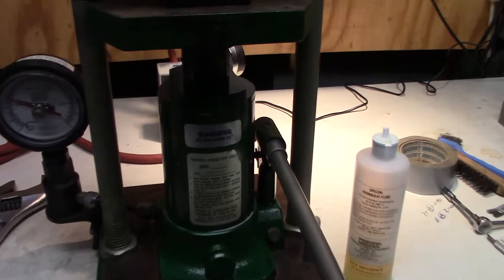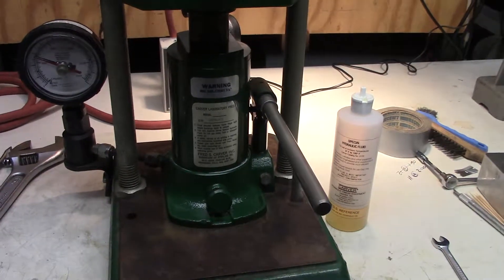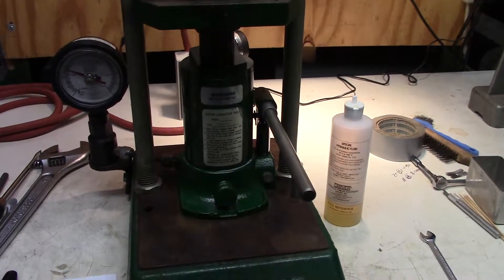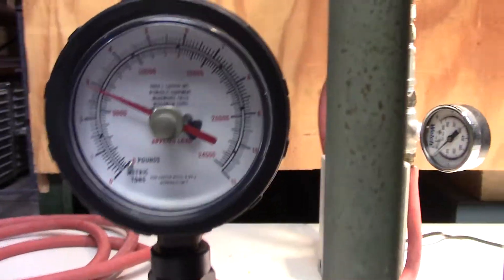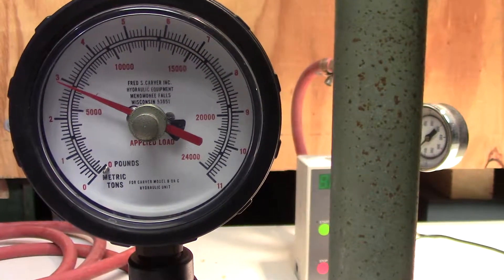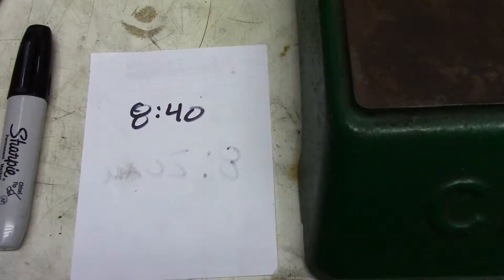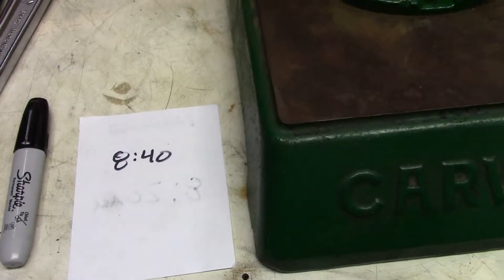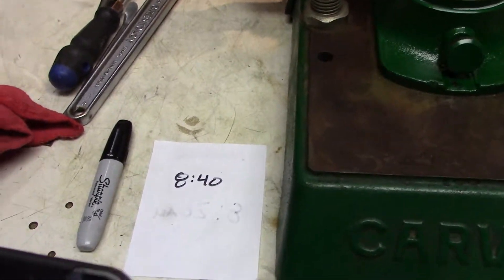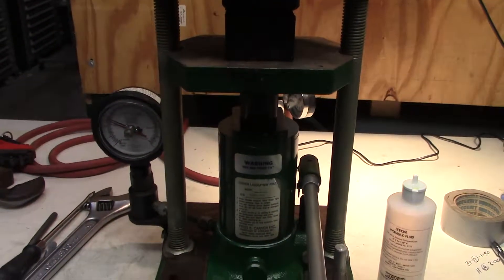The RAM seal for this RAM right here was really bad, and I've replaced a couple other seals also. I've had this at about 3 tons of pressure — or about 6,500 pounds of pressure — since about 8:30, but I wrote down 8:40. Right now it is 10:30, so it's been under pressure for about 2 hours.